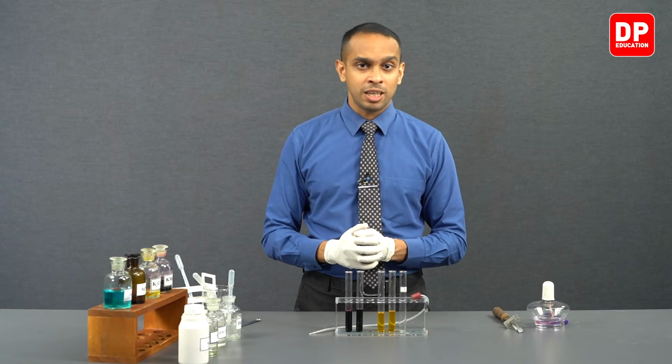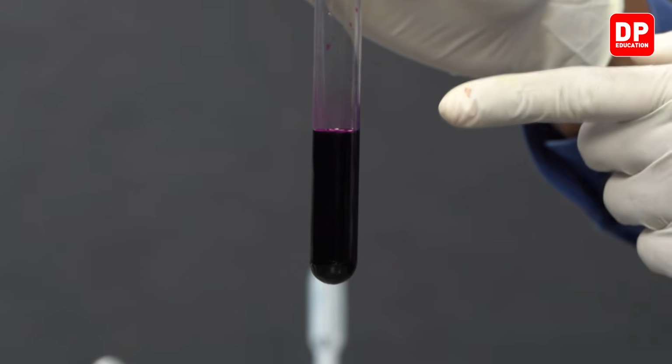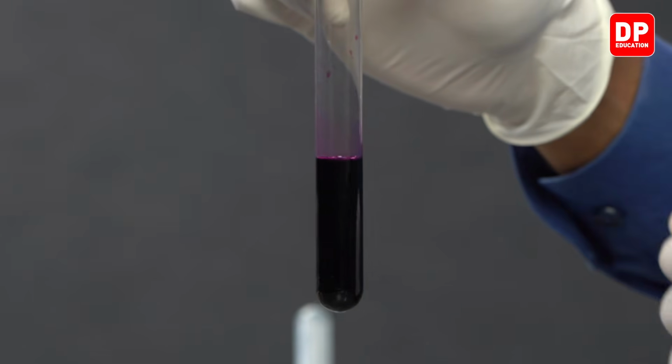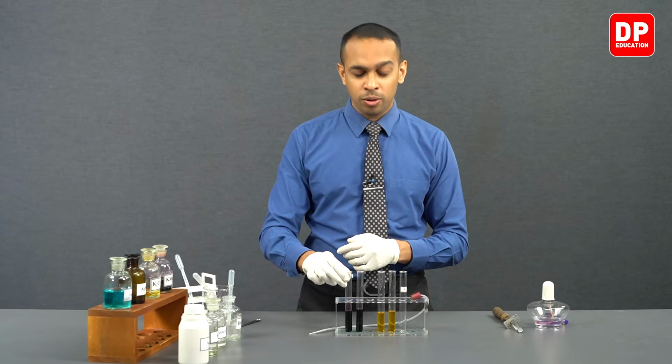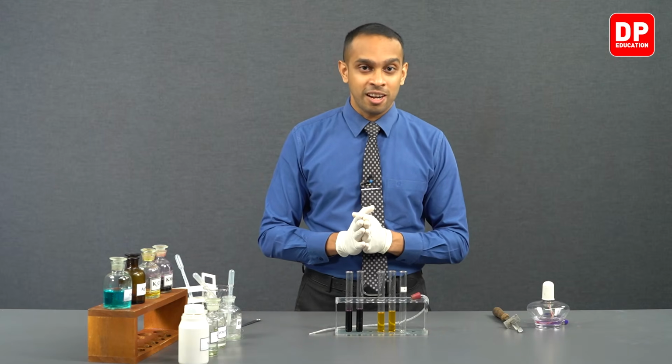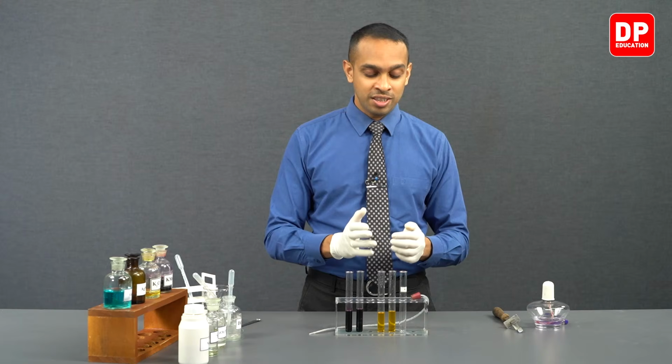As this reaction takes place, hydrogen sulfide will produce colloidal sulfur, which will make the solution milky. So you're going to observe the formation of a milky solution here, which doesn't have a color. It's going to be basically a milky solution due to the formation of colloidal sulfur or due to the formation of solid sulfur. So let's go ahead and observe these reactions.